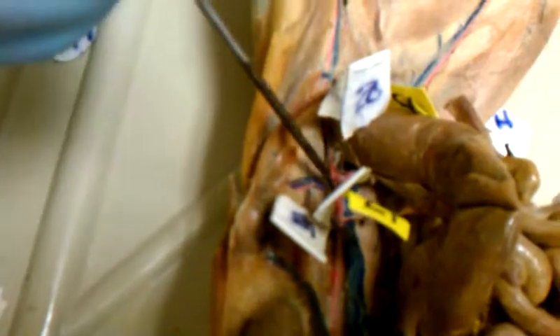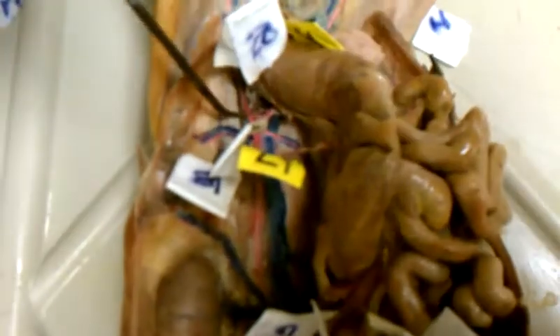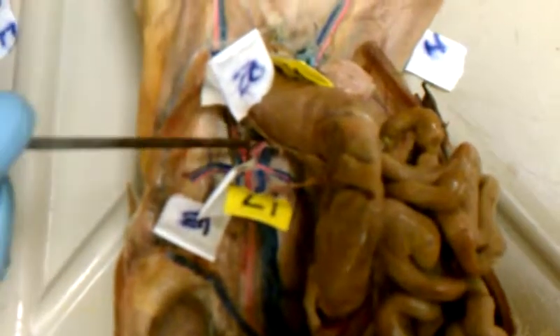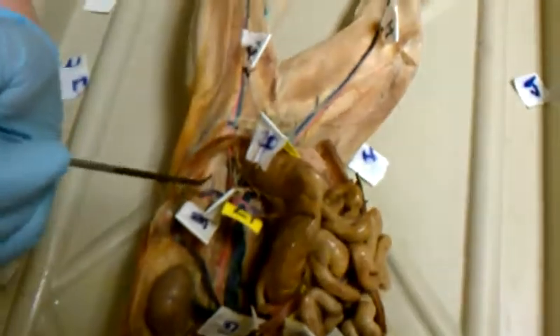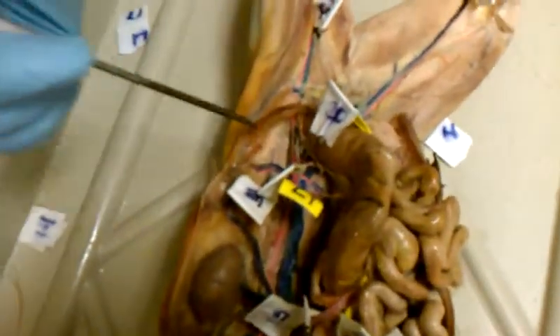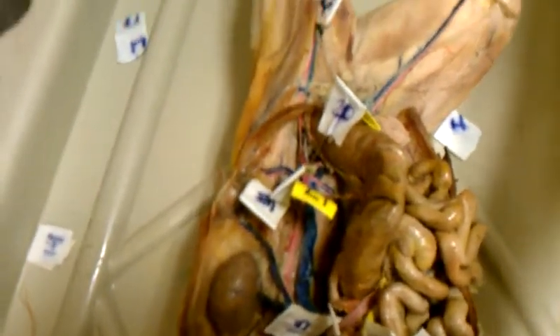So the external one starts sooner. It's superior, and it's superficial. And the internal, oh, it's the one inside that Y. Inside the Y, underneath, it's posterior. Well, no, it's inferior, and it's deep too. So the external, and this is the internal underneath it, and the same thing goes with the veins. Exactly the same, except blue.